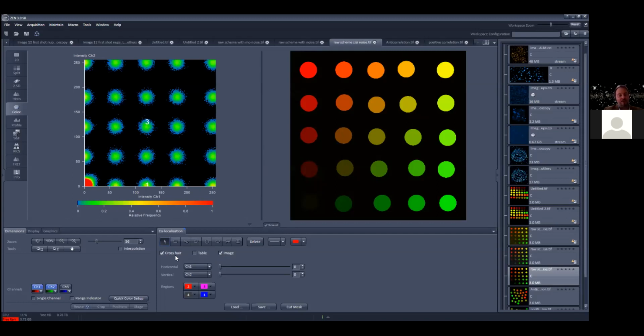So the first thing to talk about is this crosshair here. The crosshair is placed inside the left image. You see this number 3 here. This means this is the third quadrant. If I click anywhere on the image, for example here, I will see a quadrant number 2, a quadrant number 3, a quadrant number 1, and a quadrant number 4 in that case.